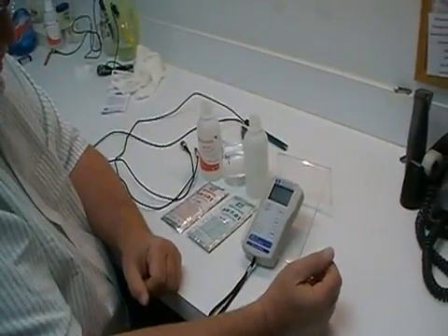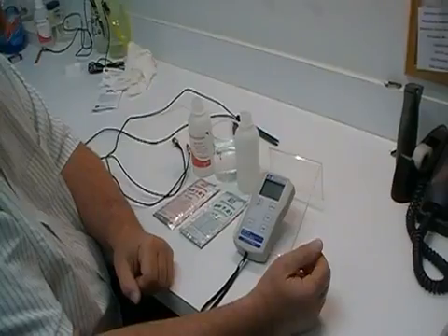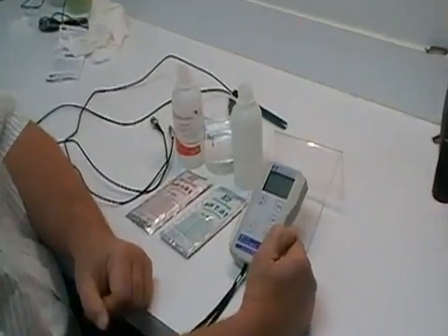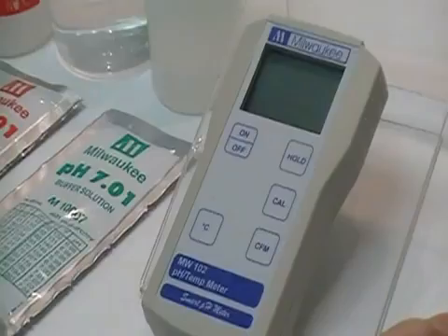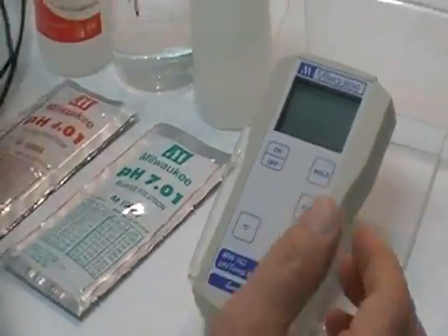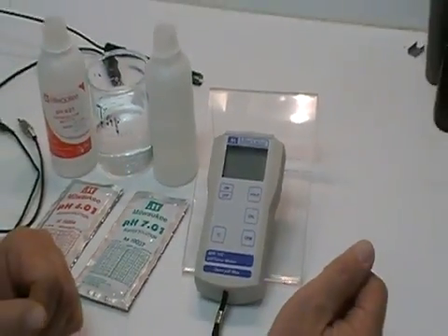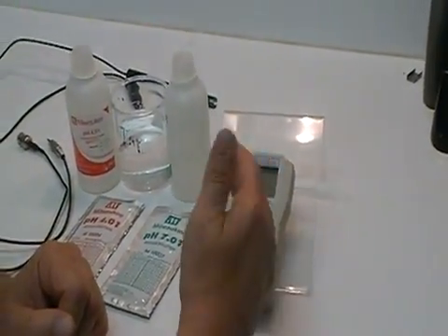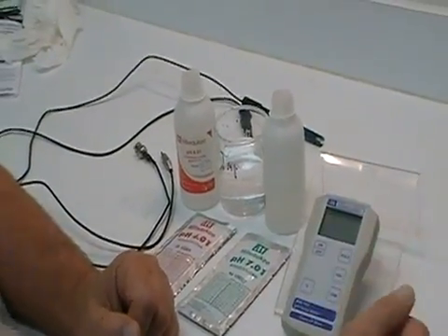Today we're going to demonstrate the calibration procedure for the MW102. This has an automatic calibration procedure. It also has a hold feature that will freeze the display so you can pull the probe out of the liquid you're testing and still hold the display in a frozen mode, so you can take it and show it to someone else or read it in a more convenient location.